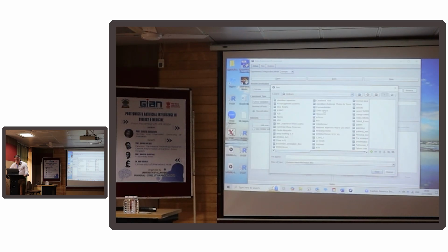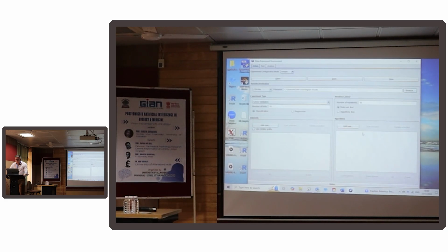Right, we have a GAN course folder here. So I've set up where the results need to go.